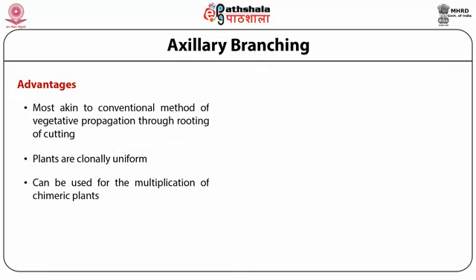We transfer it to fresh media largely because what happens in the culture media after 2 to 3 weeks is that it gets depleted in the major salts, and there is also a general healing process. So the cut end gets sealed, and it will no longer absorb nutrients.